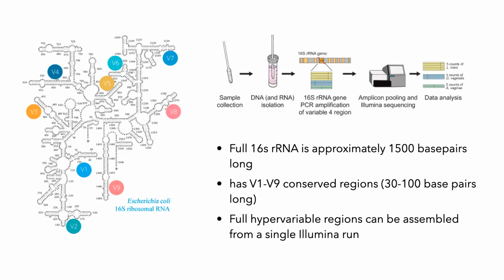These studies commonly utilize the Illumina platform, which produces reads at rates 50-fold and 12,000-fold less expensive than 454 pyrosequencing and Sanger sequencing, respectively. So it is 12,000 times less expensive than Sanger sequencing, right? So that makes it much more affordable and much more available for people. So while cheaper and allowing for deeper community coverage, remember the key is coverage, Illumina sequencing only produces reads that are anywhere between 30 to 300 base pairs long.